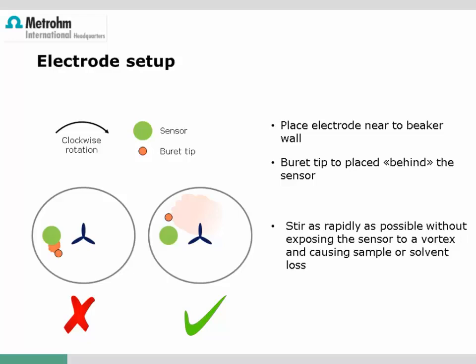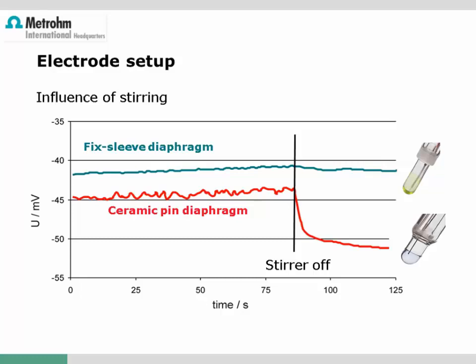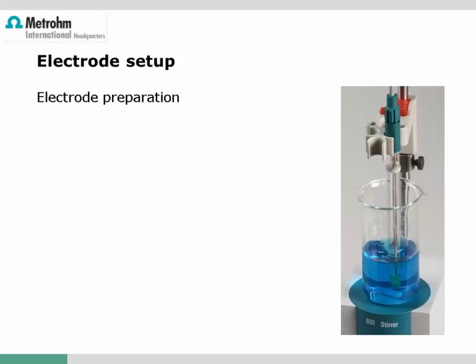Stirring should be as fast as possible, but a vortex should be avoided since the sensor might not remain fully immersed or the sample solution may spill. Beaker and stirrer sizes should be fixed and not changed, otherwise stirring efficiency may vary. The effect of stirring can be shown with a practical example using deionized water: once the stirrer is switched off, a fixed sleeve-type electrode provides a stable signal, whereas a significant signal drop is observed for an electrode with a ceramic pin diaphragm. Therefore, we strongly recommend always working at the same stirring speed and using fixed sleeve-type electrodes for pH titrations to a fixed endpoint.